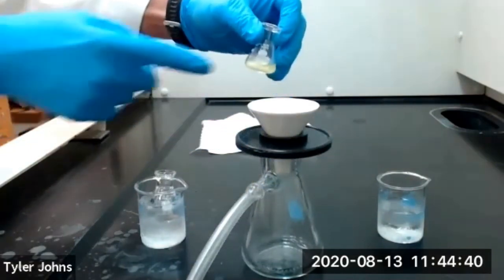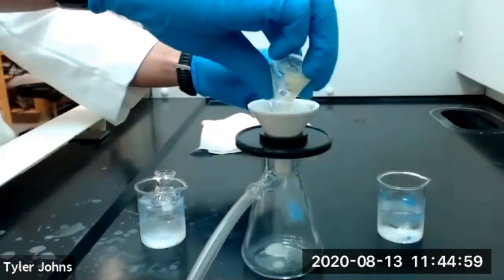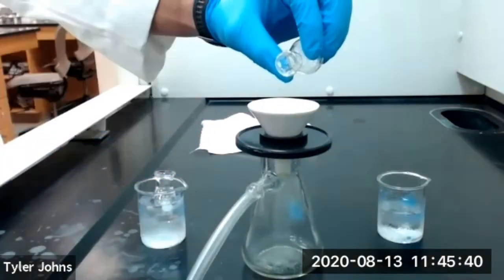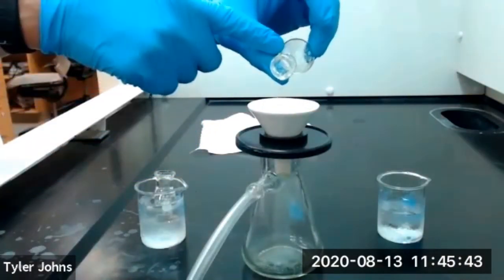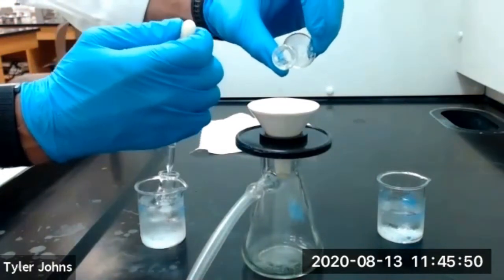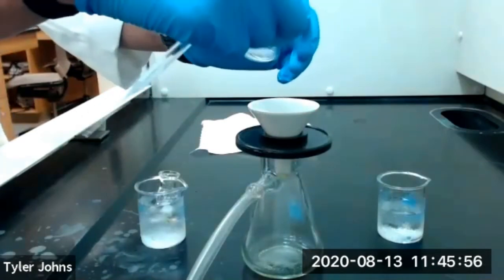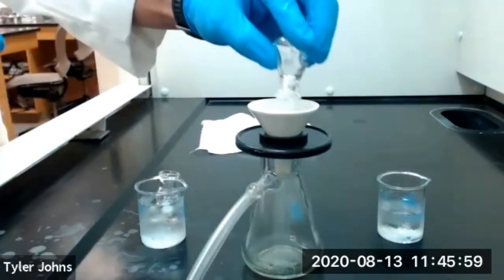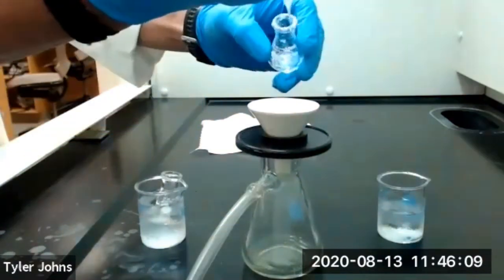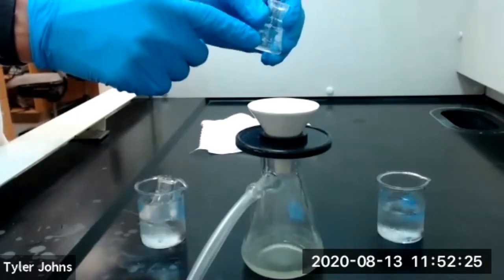We'll then transfer our crystals to the Hirsch funnel with our filter paper while the vacuum is running. To make sure we collect all of our crystals from our Erlenmeyer flask, we'll use 1 mL of ice-cold ethanol to wash our crystals in the flask and aid in transferring them to our Hirsch funnel. This 95% ethanol will also help wash our crystals. We've now transferred all of our crystals to our Hirsch funnel.